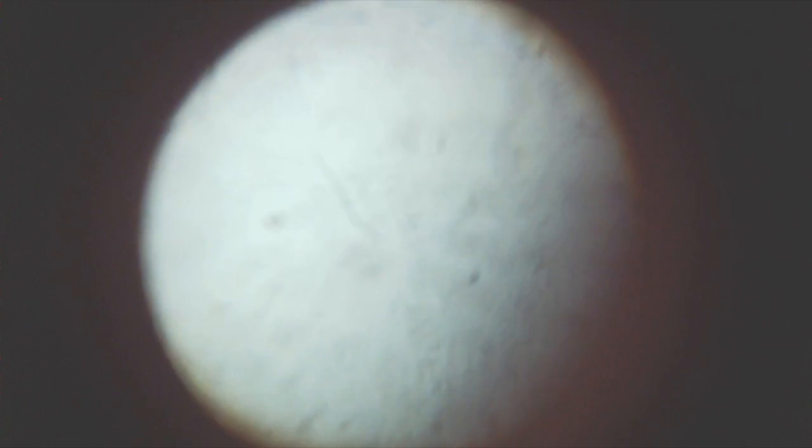Overall, the microscope works decently well at magnifying, which is what it's supposed to do. It takes a bit of practice to find specimens by moving the slide around, and it's a bit tricky to find the right focus height. But this should be fun for kids learning how to use a microscope for the first time.